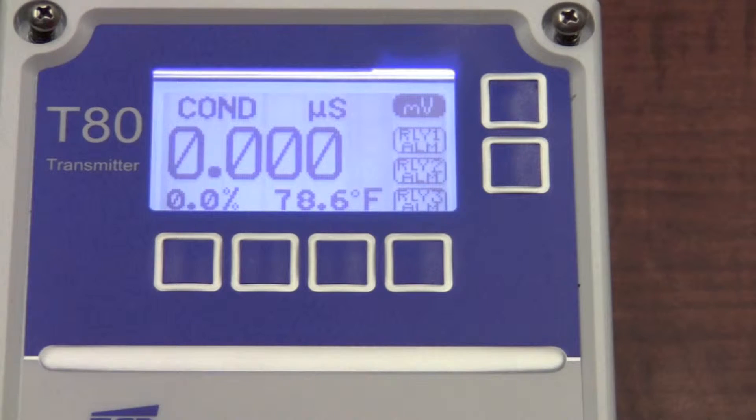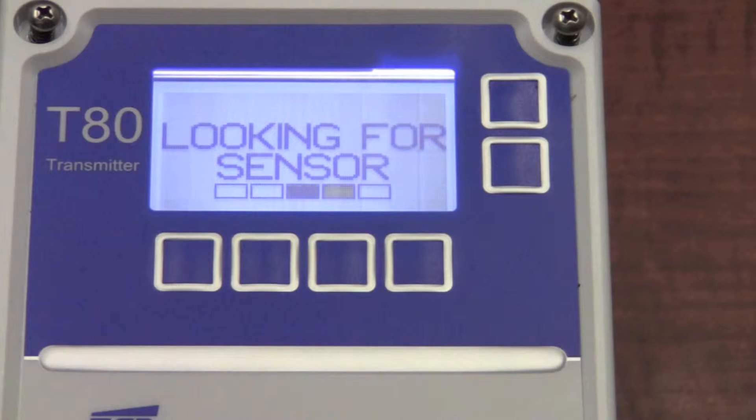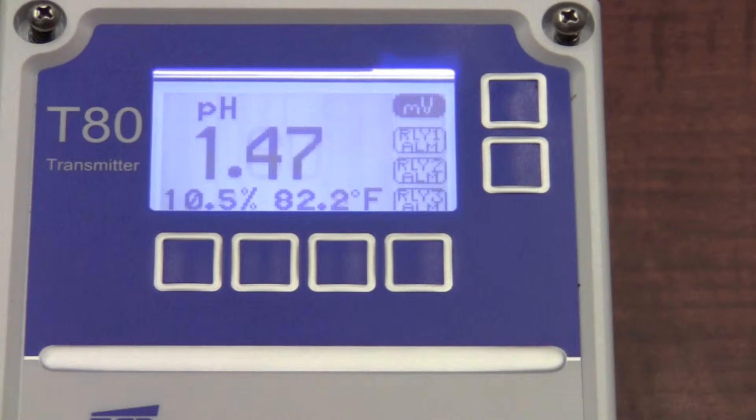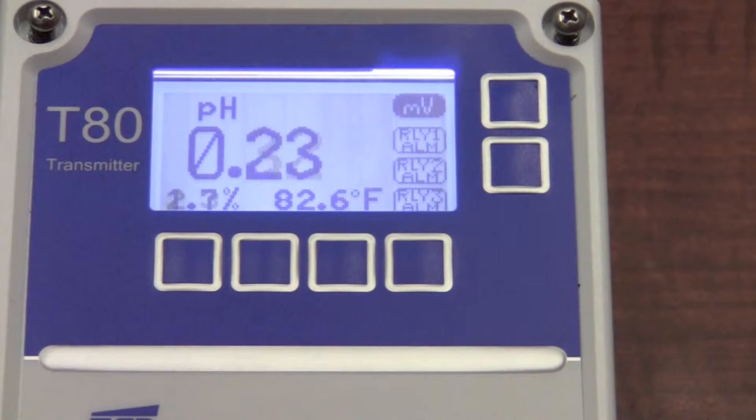I'm going to go ahead and disconnect the conductivity transmitter and reconnect a pH. It interrogates the sensor and finds that it is a pH probe.